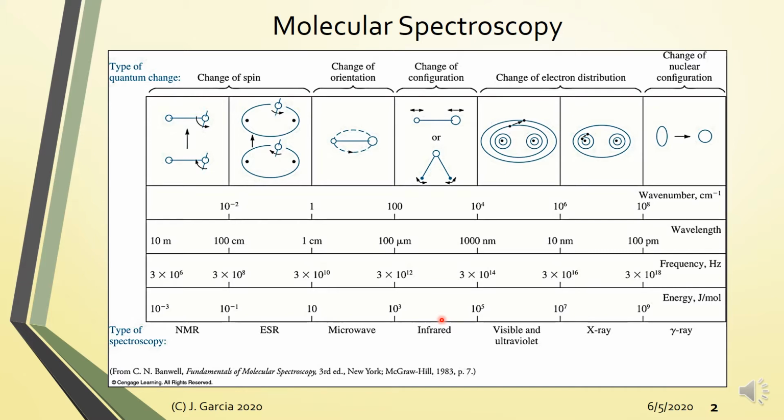So for infrared radiation, the energy is not strong enough to induce electronic transitions for the valence electrons. But what it can do is yung tinatawag nating vibrational transitions. Now, at the molecular level, vibrational transitions are basically you are inducing vibrations between molecular bonds. So that's the basis of infrared spectroscopy. Kaya ang generic term dito ay yung vibrational spectroscopy.